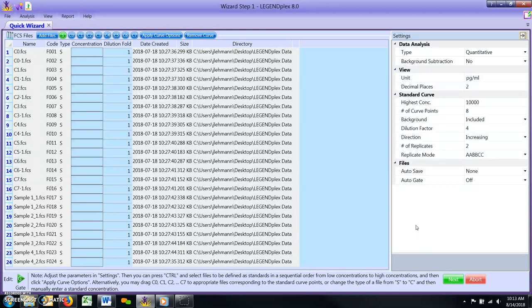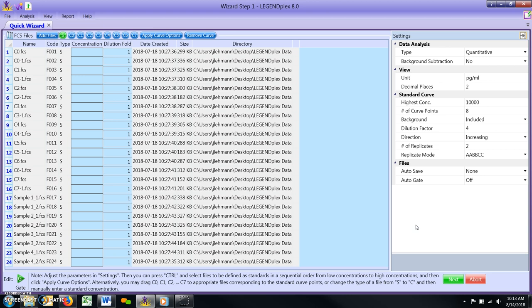The Settings window. After clicking Next, the Settings window will appear to the right of the file list. This window is used to define the parameters associated with the standard curve files from the assay. Note, the LegendPlex data analysis software has been designed so that many of the default settings in this window do not need to be adjusted if you have adhered to the protocol found in your assay manual.